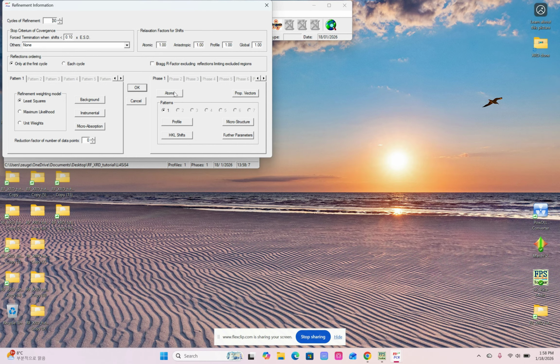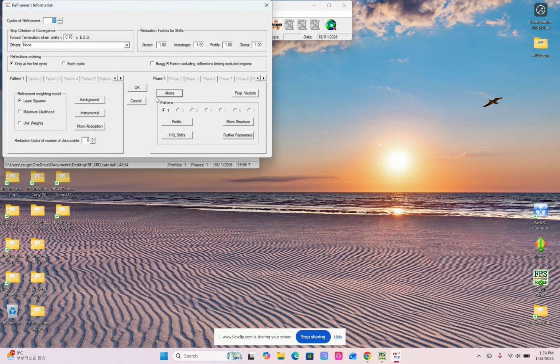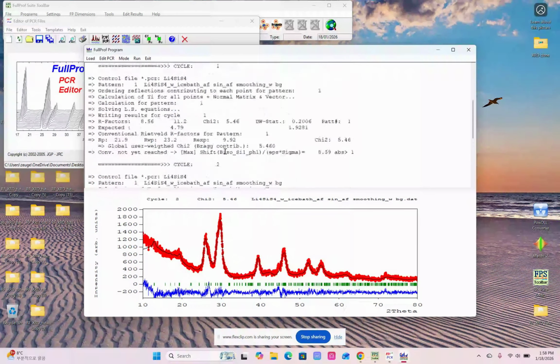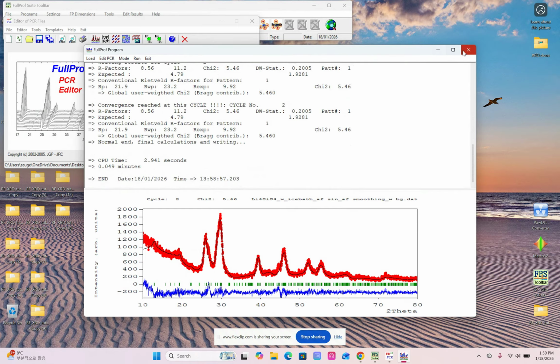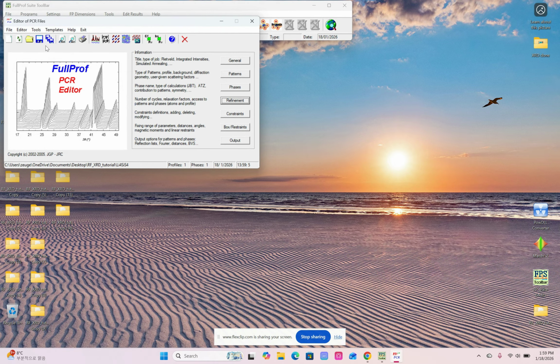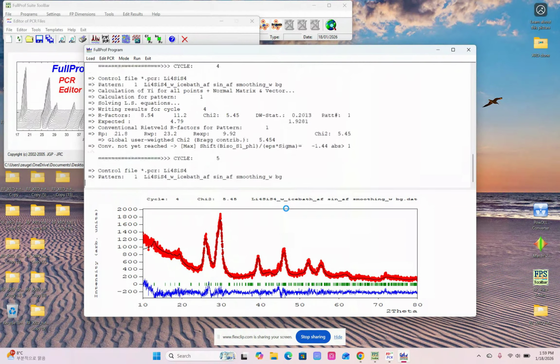After that, it's time to refine the B parameter. Before, as usual, we go through all the other parameters one more time. Let's see the B parameter. Okay, nothing changed at all. No warning, so we can continue with the other ones. Okay, let's go. It's getting better. Okay.